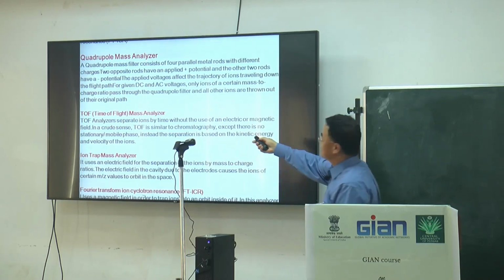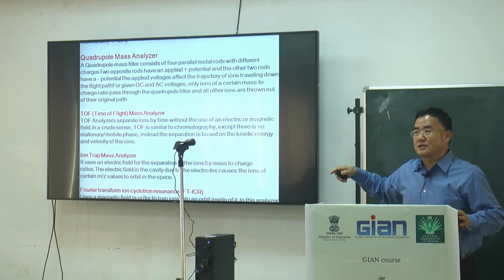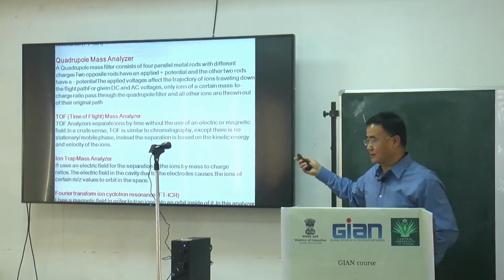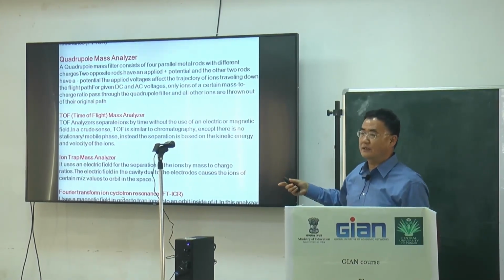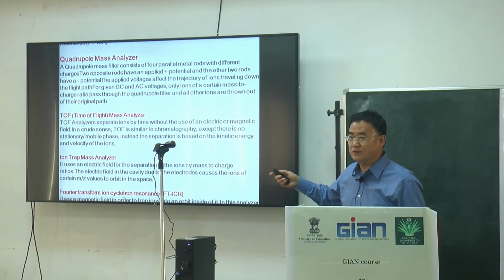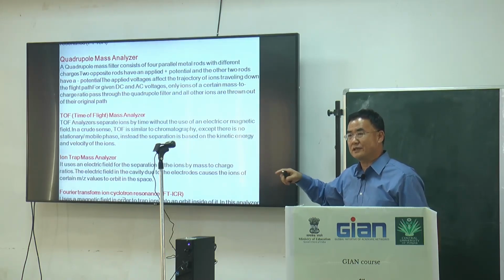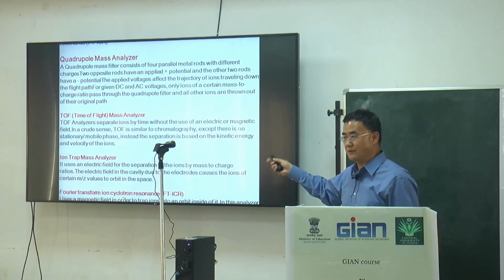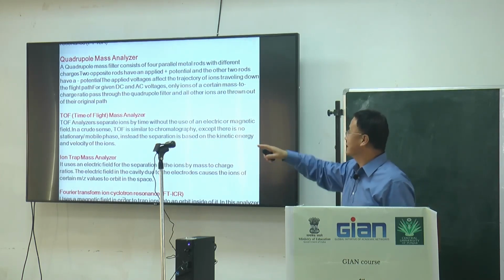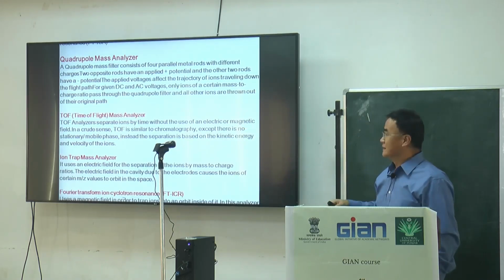The Q-Orbitrap is better for this. With an internal standard they can also do quantification, but for quality, structure determination, molecular weight and molecular formula prediction is very good, very accurate. You don't need to separate too much.